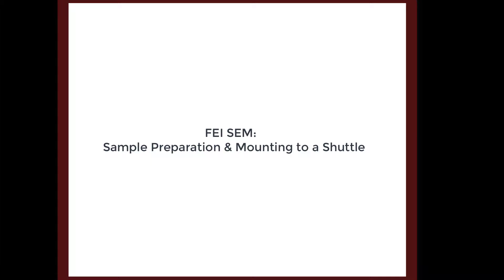In this video, we will demonstrate how to prepare your sample for imaging in the FEI SEM.